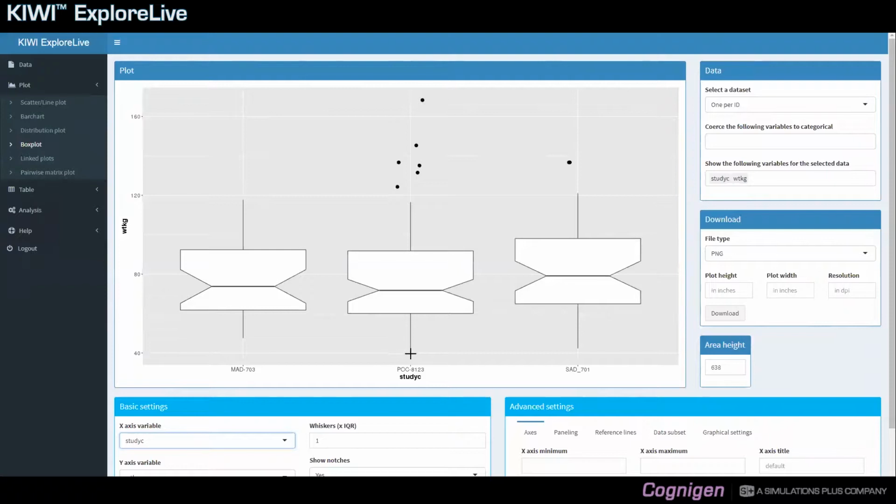The last data point within this interval delimits the whisker. Any data point beyond this is displayed as a point, and could be considered an extreme value or an outlier, depending how you're thinking about the problem.